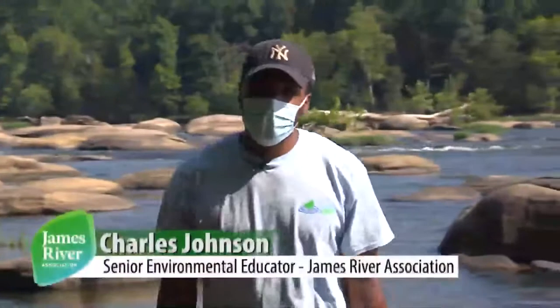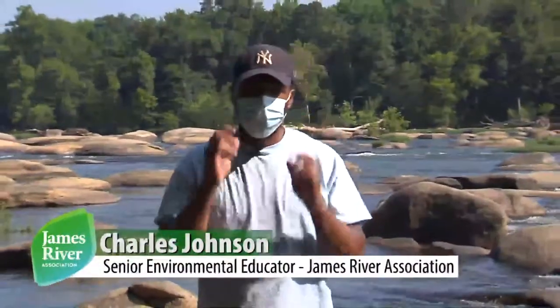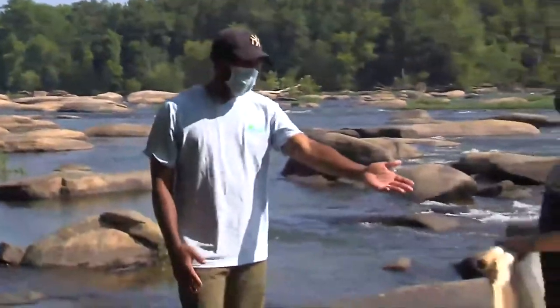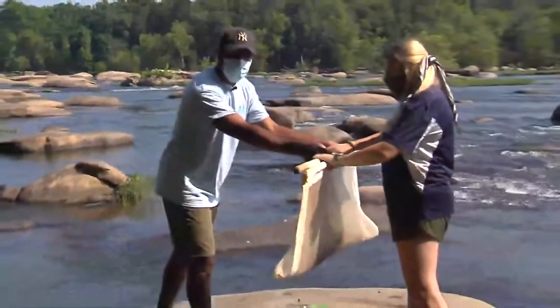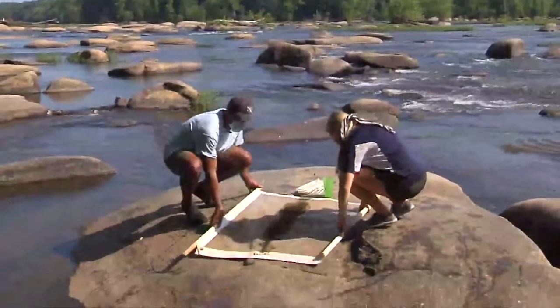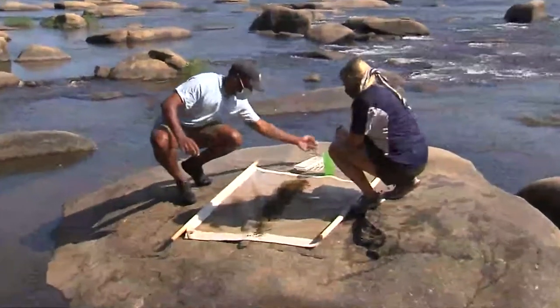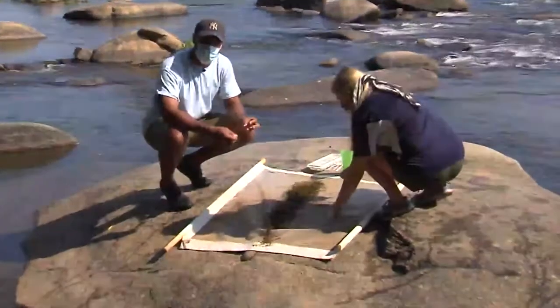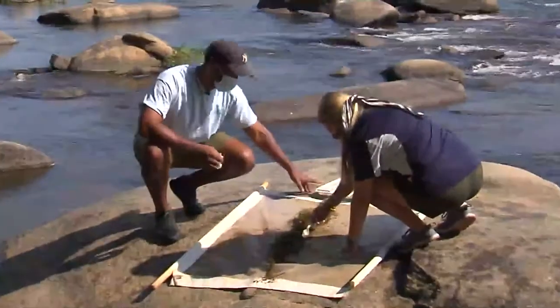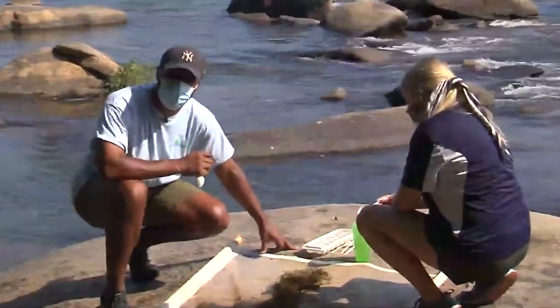Good morning. We are here today at Pony Pasture doing our macroinvertebrate water quality sample. We have our kick seine net that we just collected our sample in, and we're going to look through to see if we can find any of those macroinvertebrates that we are looking for. We're going to use spoons so we can handle these organisms with care, and then put them into our ice tray so that we can use our observation skills to see what we have collected.